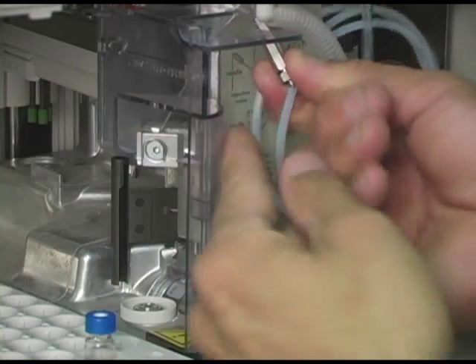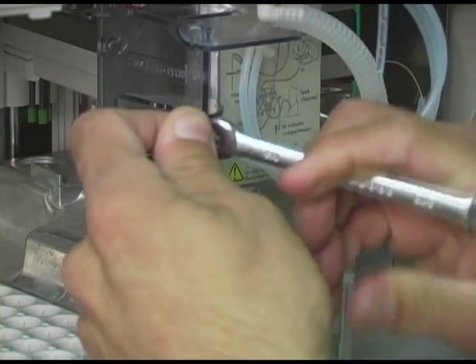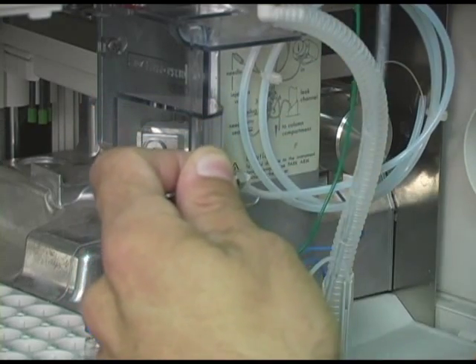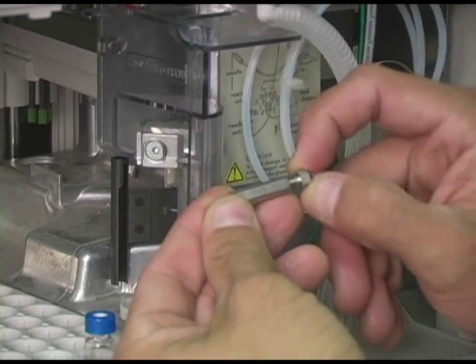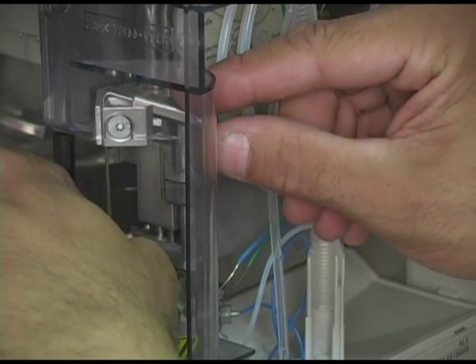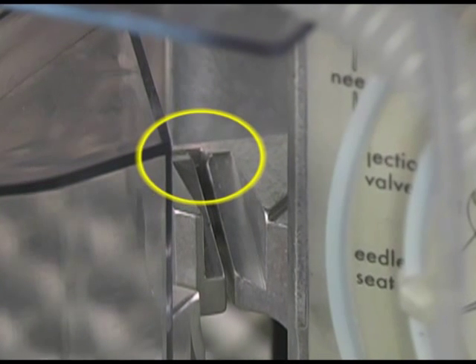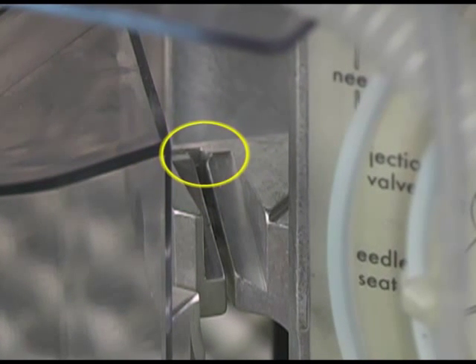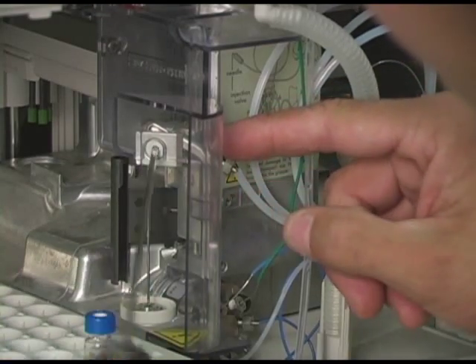With the Set Screw loosened, remove the Needle by lifting it up and out of the Needle Arm. Using two 1/4-inch wrenches, remove the Sample Loop Fitting from the old Needle and reconnect the new Needle to the Sample Loop Fitting. Tighten firmly. Carefully insert the new Needle into the Arm, making sure that it sits in the Notch at the Rear of the Arm. Once you have the Needle properly aligned in the Notch, tighten the Set Screw firmly.